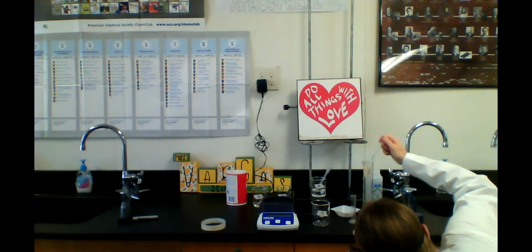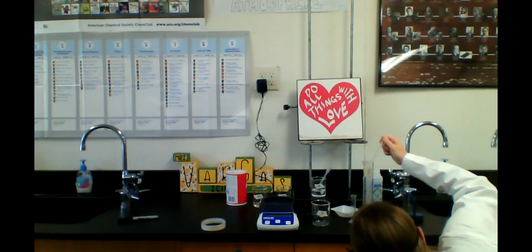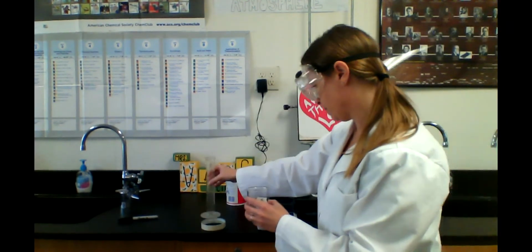And 15, 16 milliliters. Okay, so my 16 milliliters of distilled water is going in. There we go. Mix that around. So now we have our solutions prepared.